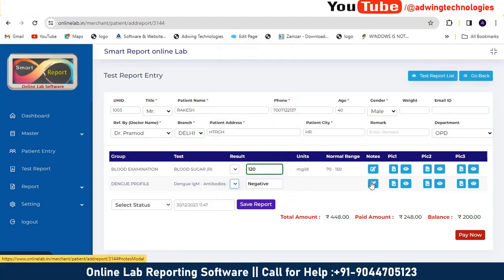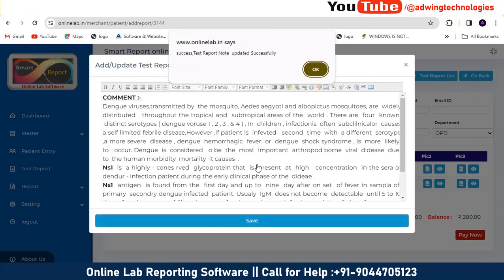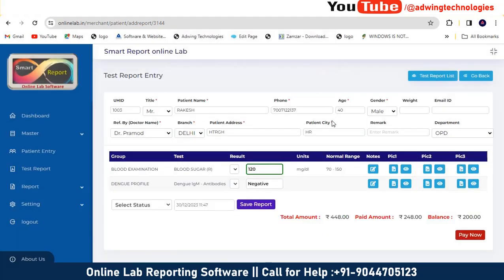If you want to write notes, just click here, notes are already added here. If you want to change color, design, or font, you can edit here. Simply save it. Success. Now you need to select the status. The report is complete. Save report. This is the date and timing.